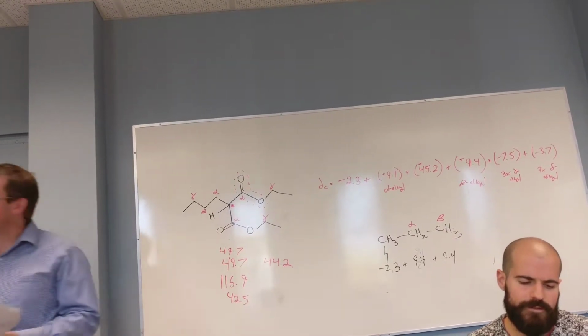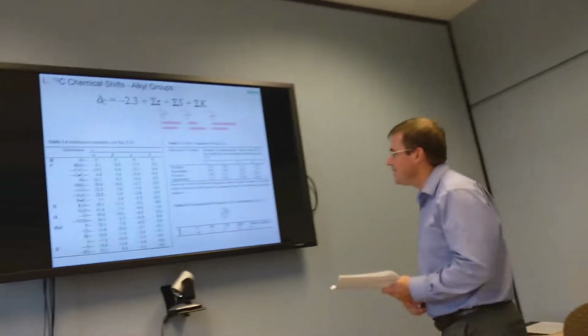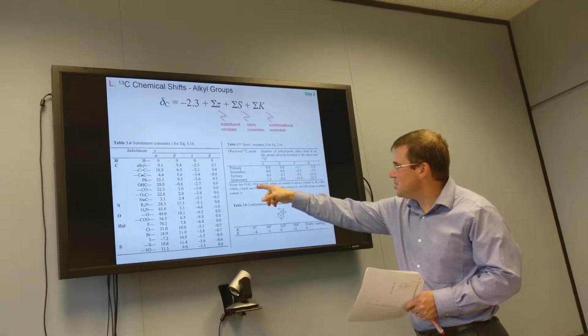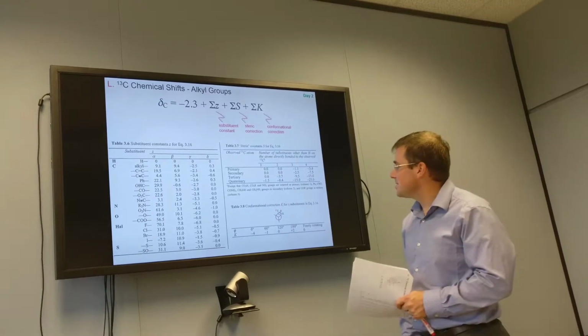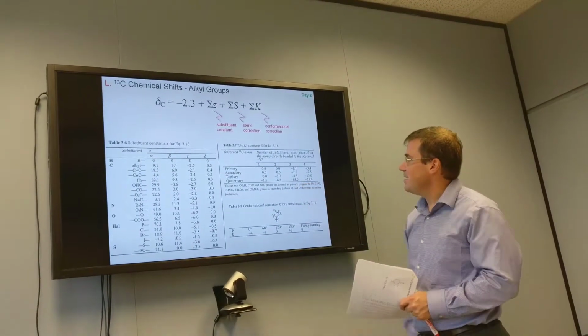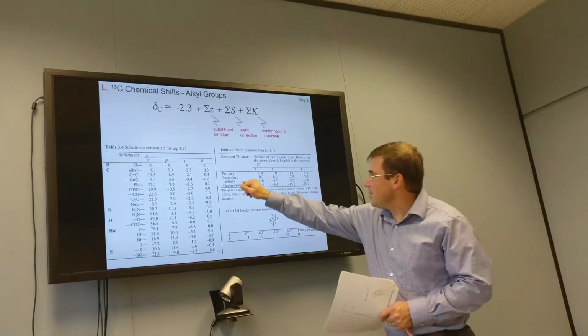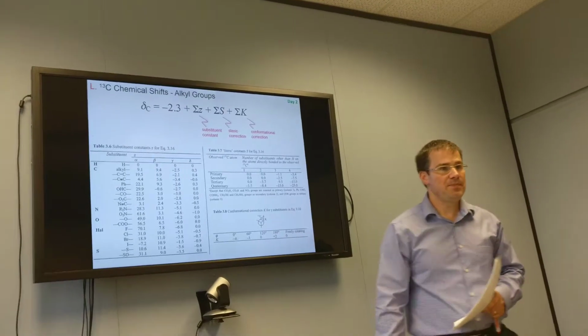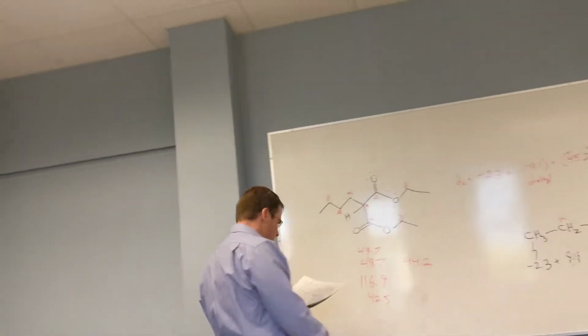So there's this little footnote here that says, except that CO2R groups, esters, are counted as column 1. So our carbon of interest is tertiary. Those 2 esters count as 0. So it's really just this group here that counts.